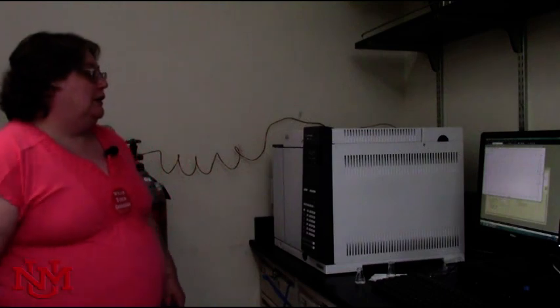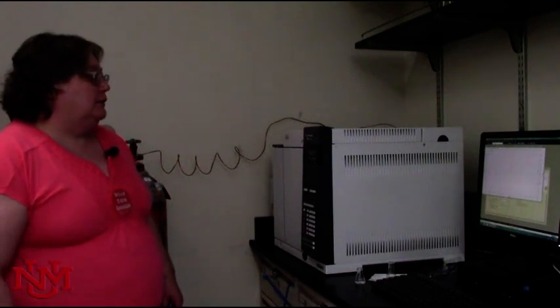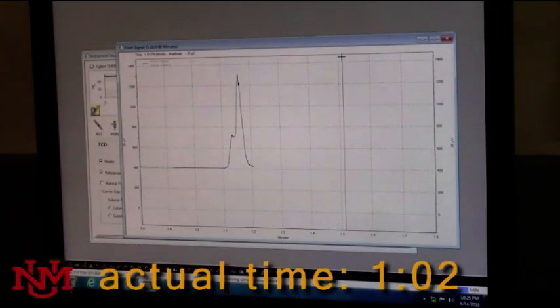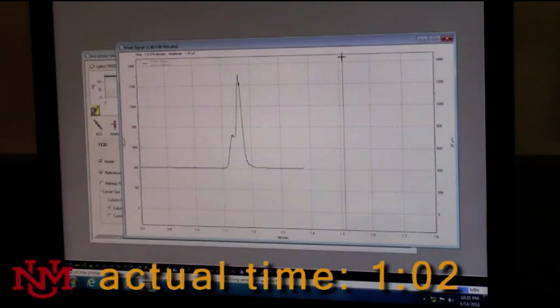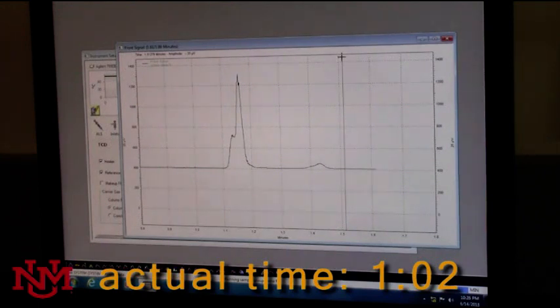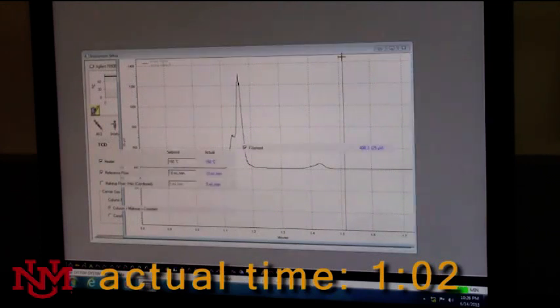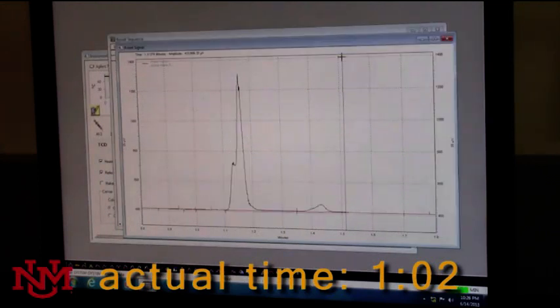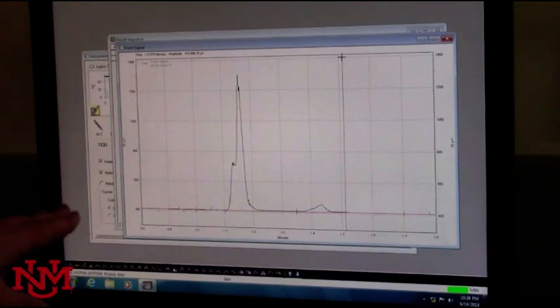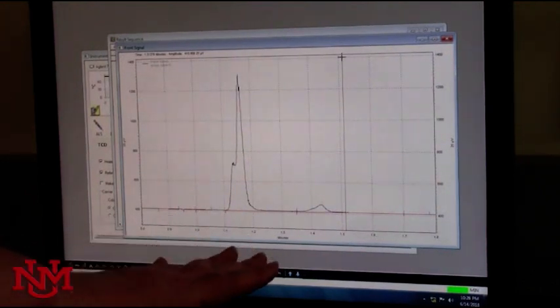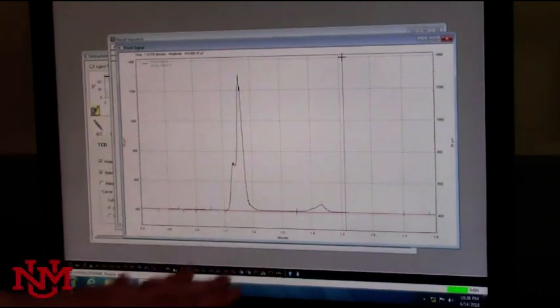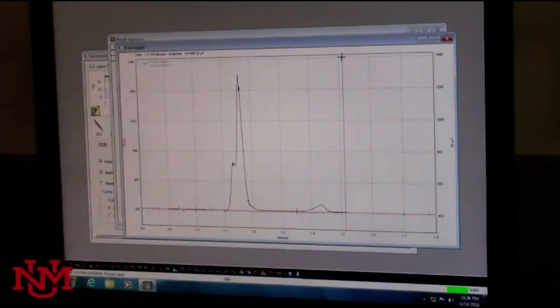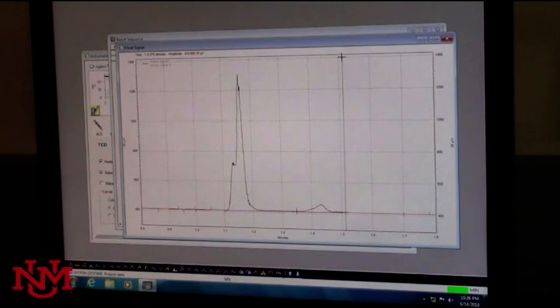Okay, let's see what happens. Once the red lines have shown up, the analysis is done and it's time for you to print it out.